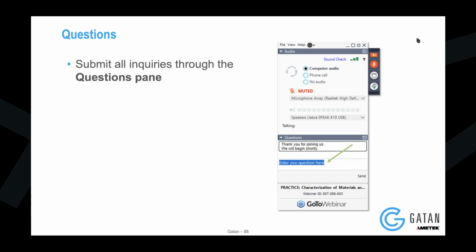Yeah, thanks. We got a couple of questions also about the barium titanate that you showed. One question was, why are the oxygen atoms more visible in the spiral scan that you used on the barium titanate compared to the raster scan or some of the other scans? Is there some sample damage going on, or maybe some scan distortions? Do you have any thoughts on that?